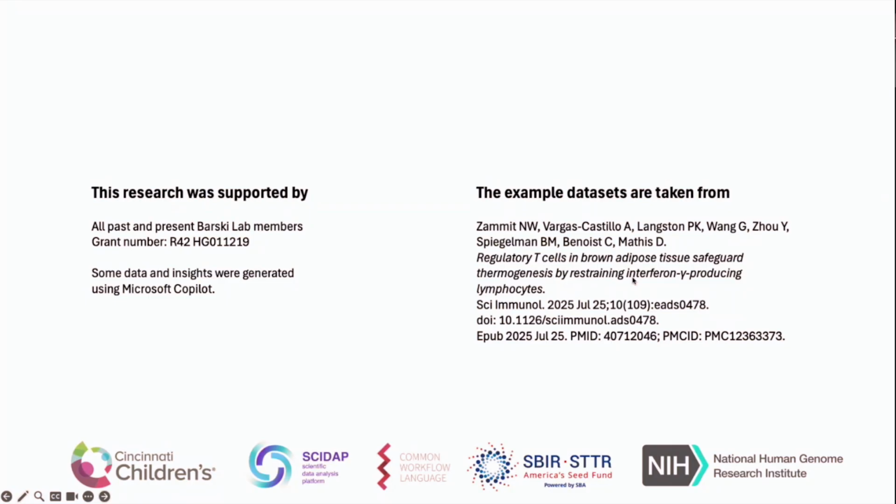I can add that I haven't tested the output from pseudo alignment in DESeq. Most probably, we will need to use some other parameters in DESeq, because I know, for example, that on the manual page of DESeq, they even explain how to run it for single cell data. Most probably, they have some advice on how to do it with the pseudo alignment results. But eventually, it will depend whether we will have a project that requires it.